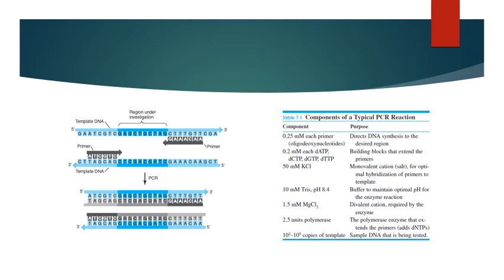Now, one of our major sources of decontamination is UV light. UV light has been used and is used to decontaminate and maintain those pre-PCR areas. That's because the UV light, as you know, will catalyze single and double strand breaks in the DNA, which would interfere with replication. So you end up with DNA still there, but its ability to be replicated is removed.